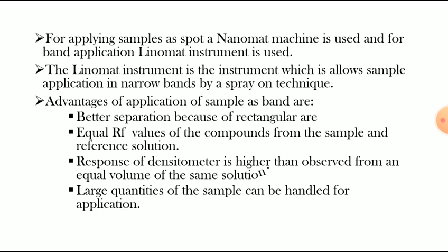Advantages of application of sample as a band: when we apply sample as a band, it has four advantages. See, the first one, better separation because of the rectangular area. Second, equal RF values of the compounds from the sample and reference solution. Third one, the response of the densitometer is higher than that observed from an equal volume of the same solution.